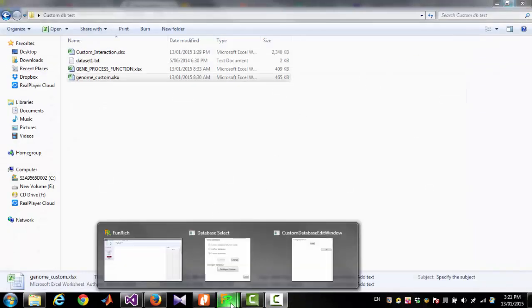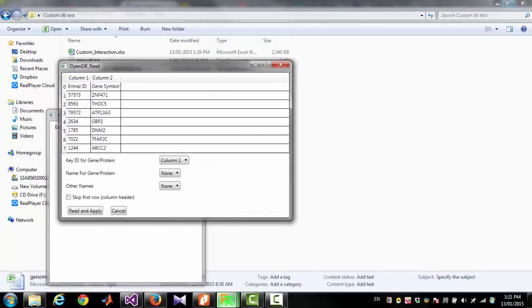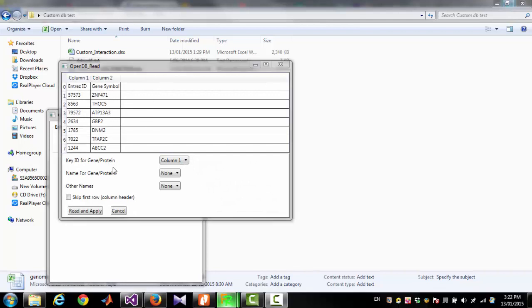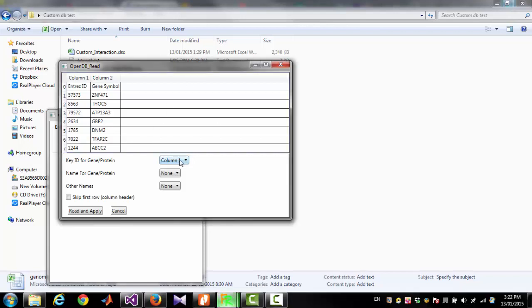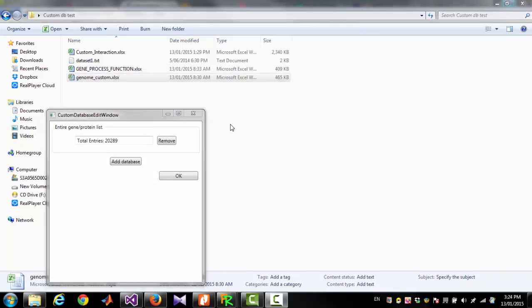In Funrich, I am going to upload this file. Here you have to select which column contains your primary identifier. In this example, this is column one. Optionally, you can select another column for a secondary identifier. I am selecting column two, which is gene symbol. My file has a column header, so I have to check the 'Skip first row' checkbox, then click 'Read and Apply.' We can see a list of almost 20,000 genes has been entered.